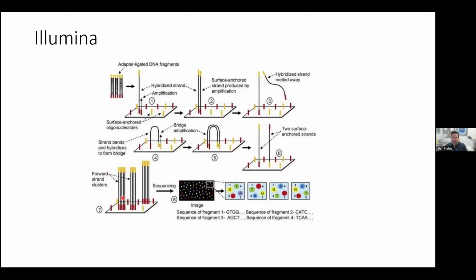So then we apply nucleic acid at the appropriate concentration so that we ensure spatial separation. We can't have too much nucleic acid from any one specific sample. Otherwise, these clusters will be too close together, and when we are reading the fluorescent images later on, they'll be indistinguishable.